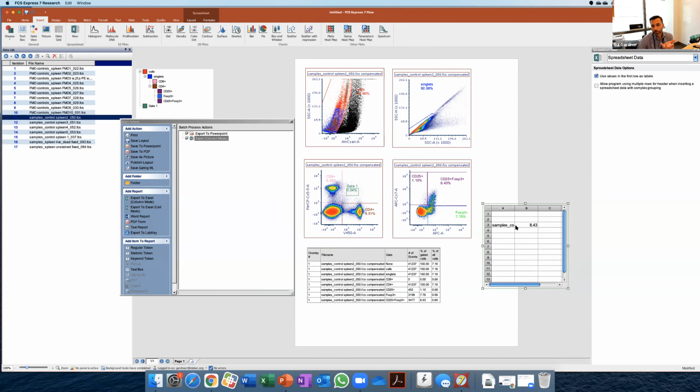Now, what is this good for? Well, what if I then decide, okay, now I want to see, I'll drag these guys over here, and now I can add these statistics, and I'll click this one also, and I'll have them in different columns, and the iterations will be in the rows, right? So I'll do the same here.